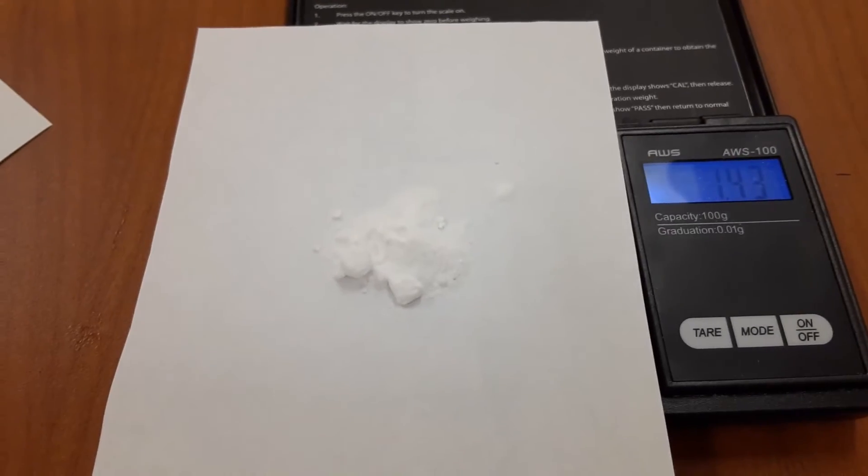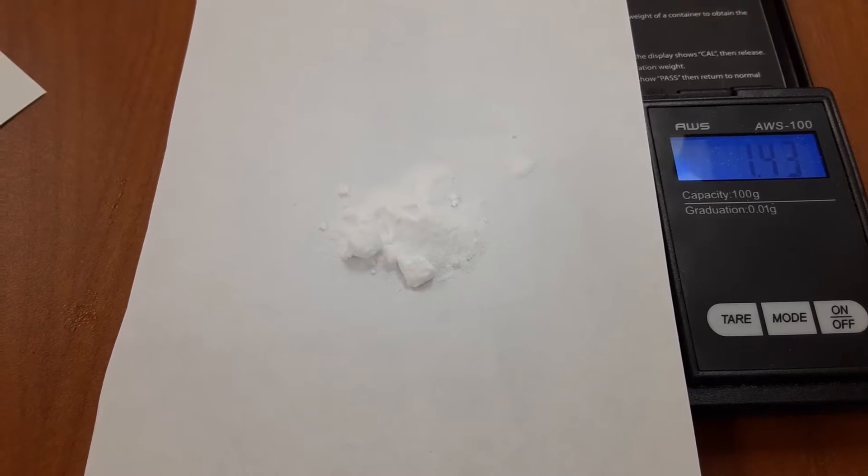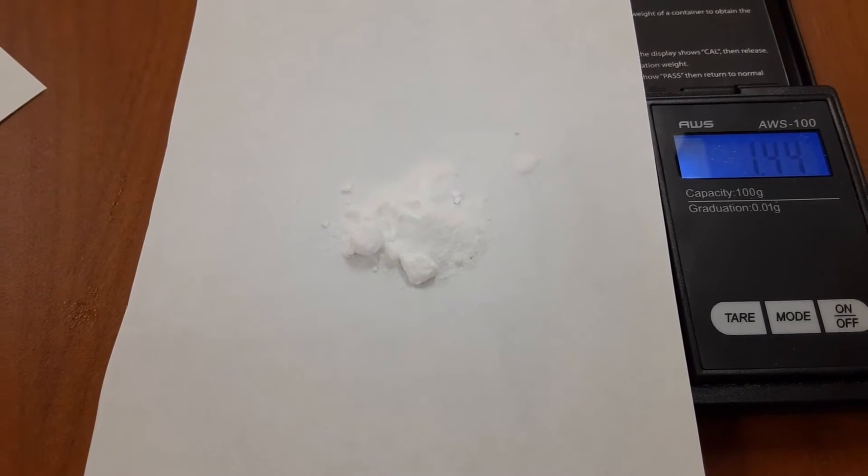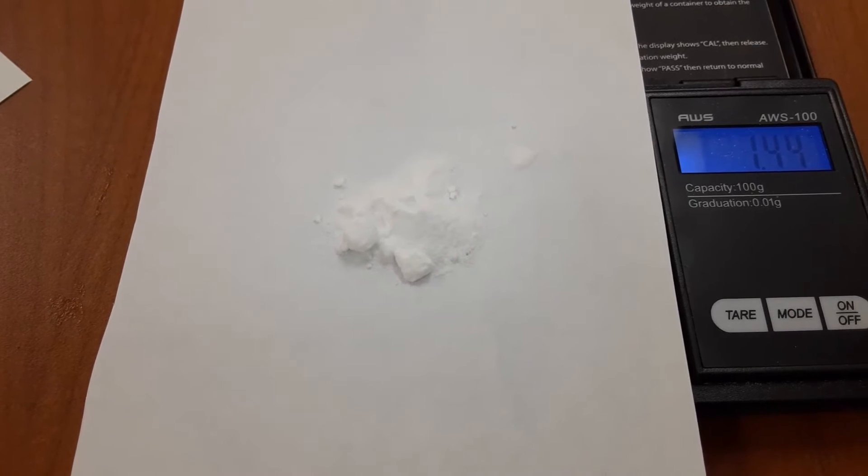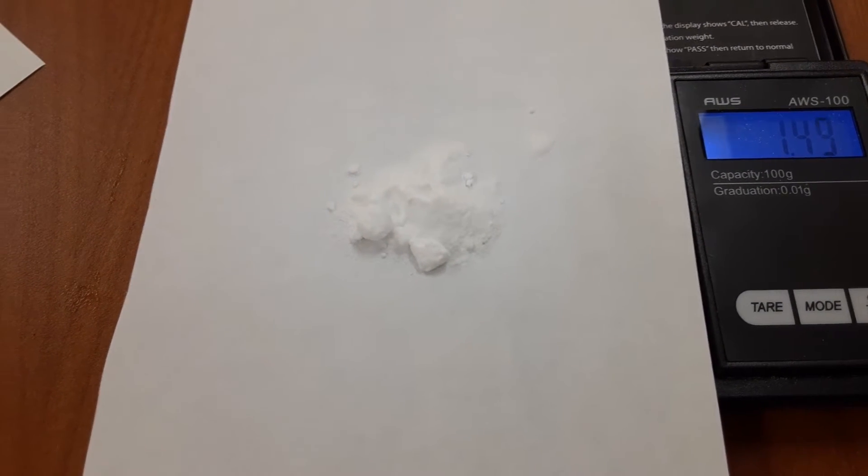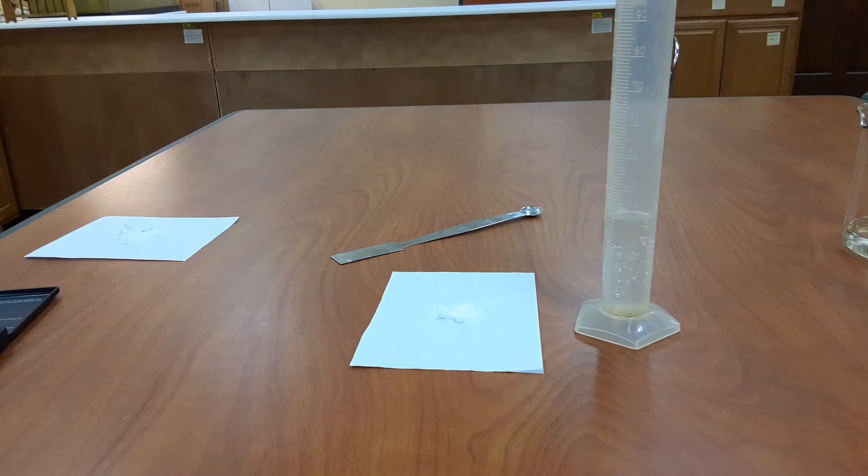So we have m2 equal to 1.44 grams. Please make sure that you write that down. We have our baking soda and we have our vinegar, and we found the masses m1 and m2, so you can add them together. When you add them together, that would be your initial mass. This is the mass of the reactants plus the mass of the graduated cylinder, but we will have the mass of the graduated cylinder also as part of our products, so that doesn't really need to be subtracted. So m_initial is m1 plus m2.